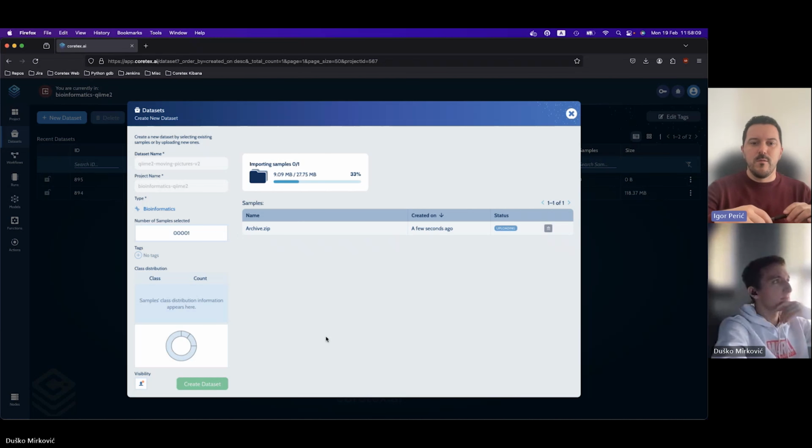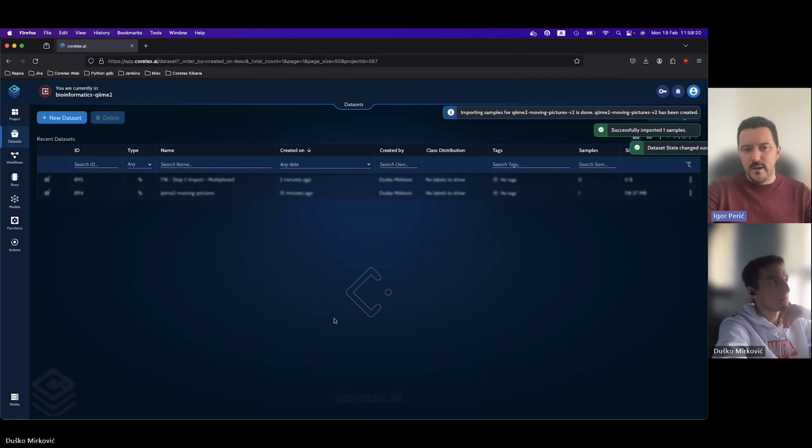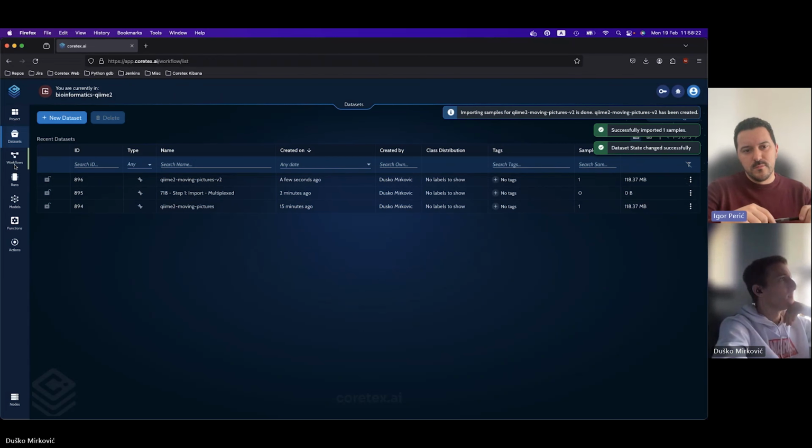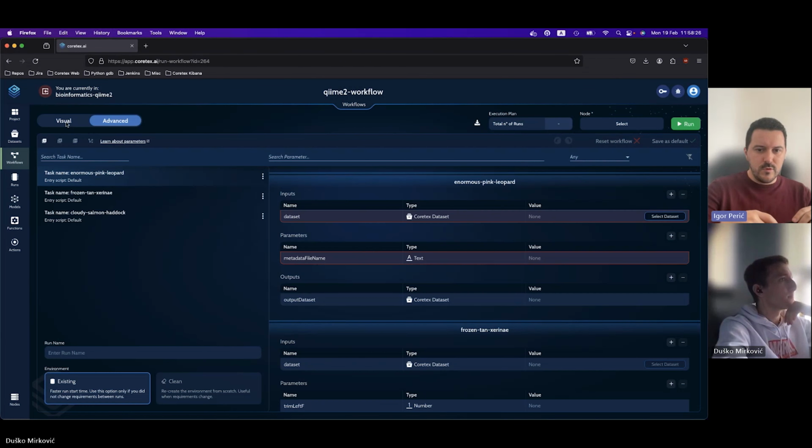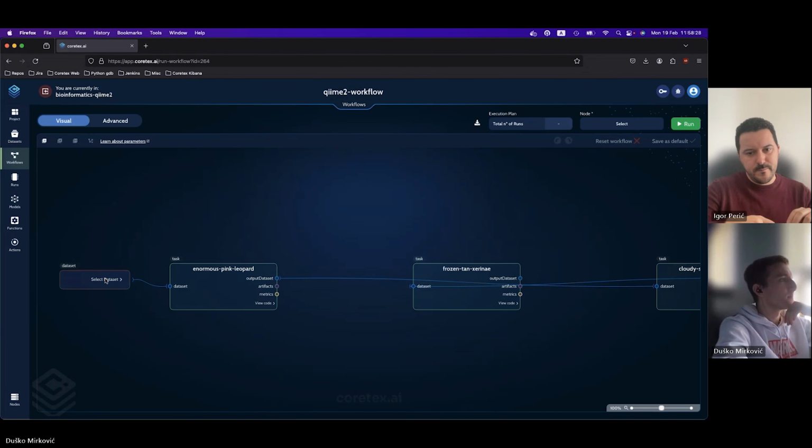For instance, if you really wanted to have your file named, what was it, forward.fasta or something like that, then you should have had an option to specify that and to select that file. Yeah. These templates are written this way, so there's definitely room for slight improvement there.